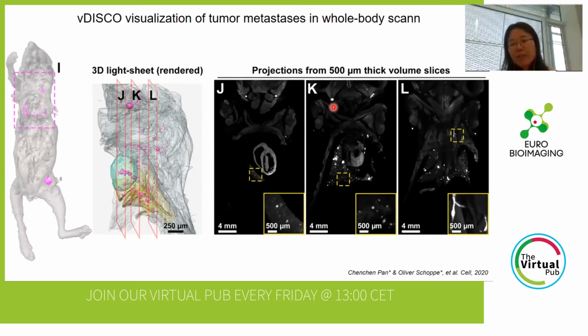axillary lymph node part. So basically, we can see that the metastasis actually happened deep inside your organ. When we are using bioluminescent imaging, this kind of signal is very difficult for us to judge whether it is right or not. With our method, we can clearly see that a metastasis really happened here.